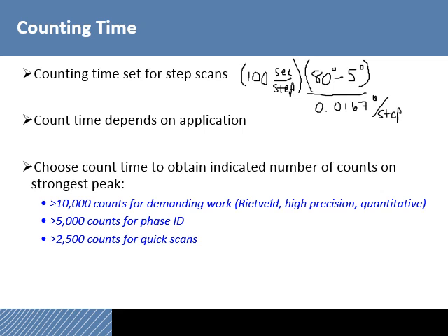But the new modern detectors, like I said, are actually solid state linear detectors that have multiple channels that collect multiple angles at once. The detector downstairs in CCR actually has 127 channels. So it has the ability to collect 127 angles all at one time. And as it passes through each particular 2 theta position, you'll collect that 2 theta position 127 times.